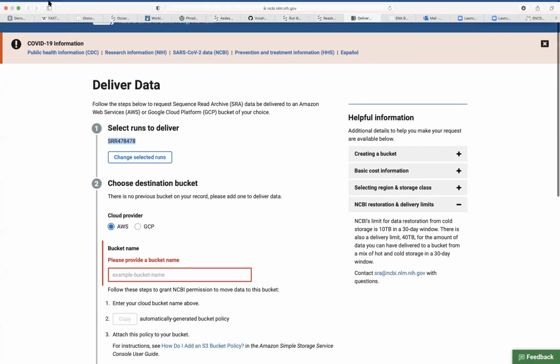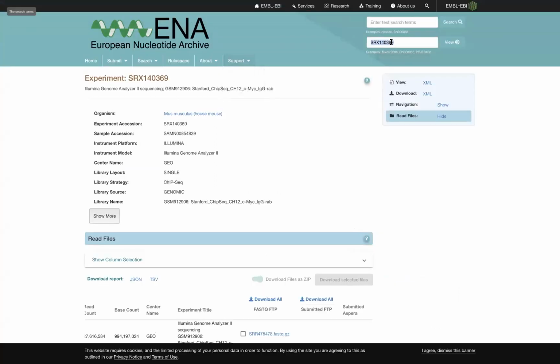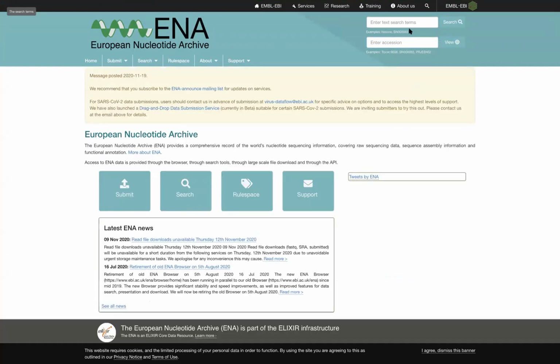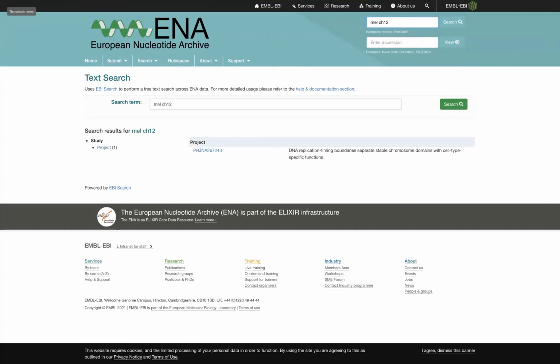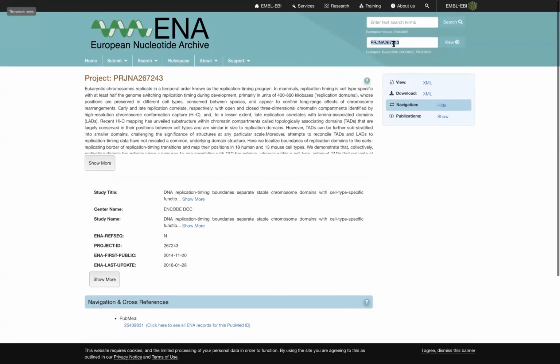So we can go to ENA. Oh, this is the bit I wanted to show you from SRA, sorry. I'll come back to that later. So this is ENA. Let me start that again. Let me just come back to the home page. So this is what ENA looks like. The problem with ENA is it's not quite so friendly with free text search. It won't even let me type that in. Nick, Mel CH12. Oh, I can't type, I'm sorry. Oh, we got something there, but it's not actually the one I want.